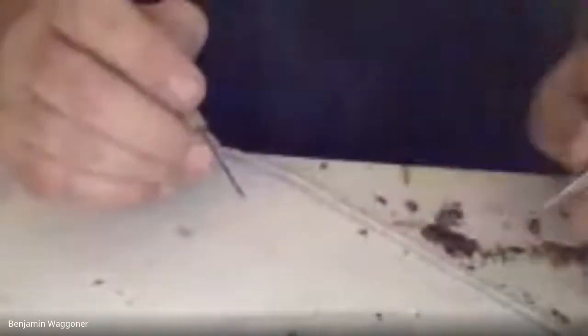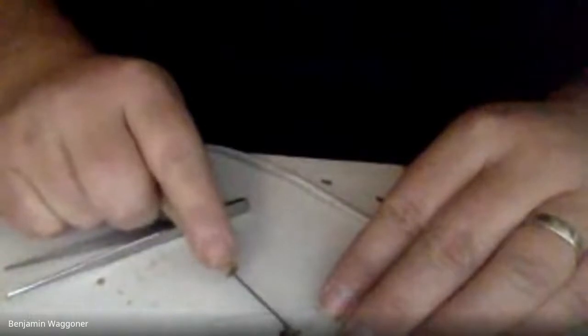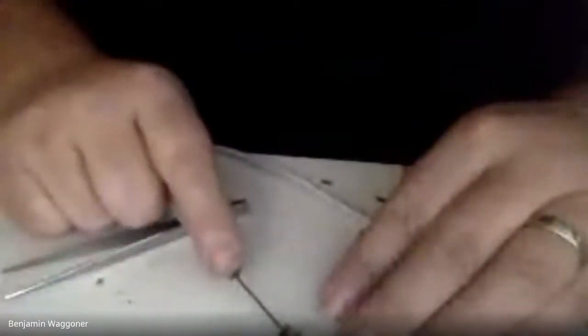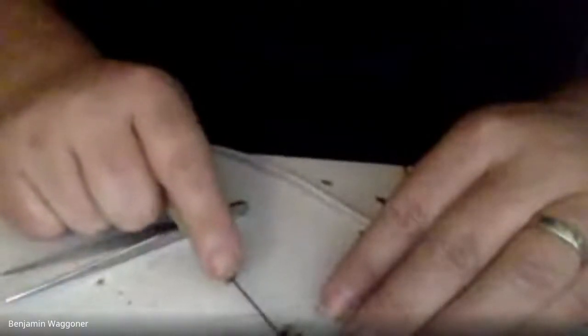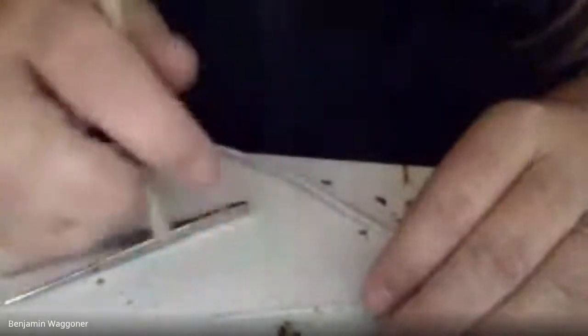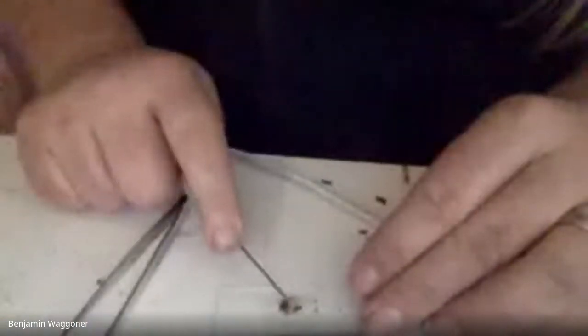Actually, I'm going to do one thing first. I don't just want to look at the gut. I want to look at what's inside it. So to get the gut contents out, if you've got a large gut, you can try kind of milking it. In fact, I think that's what I'm going to do here, given how small this thing is. I'm going to put the cover slip on, but I'm going to use the point of my probe to press down on it and maybe see if I can't strip it a little bit. With mealworm gut, you can kind of milk those just to try to squeeze out as much gut fluid as possible. Or you can use the blunt end of the probe and just kind of mash down a little bit on the gut like that, or kind of strip it like that.